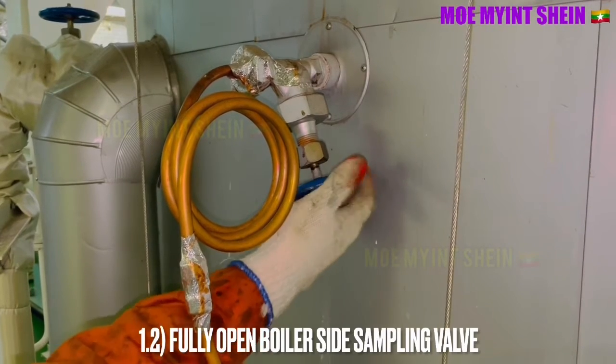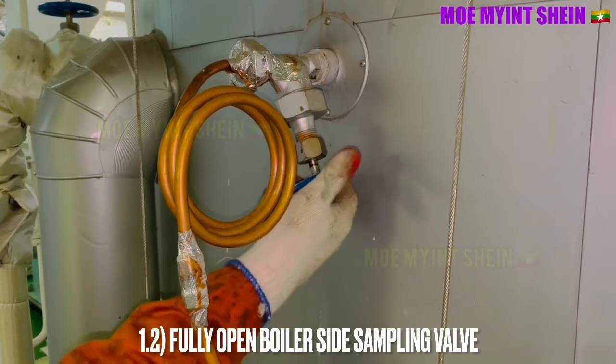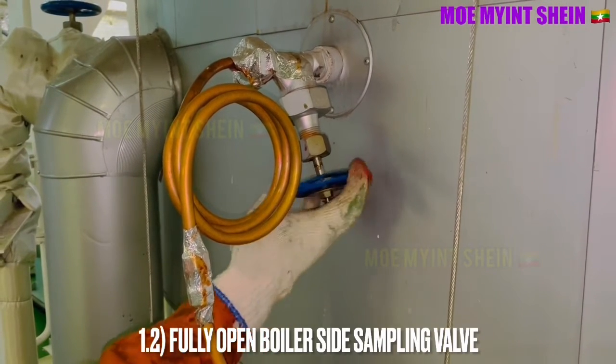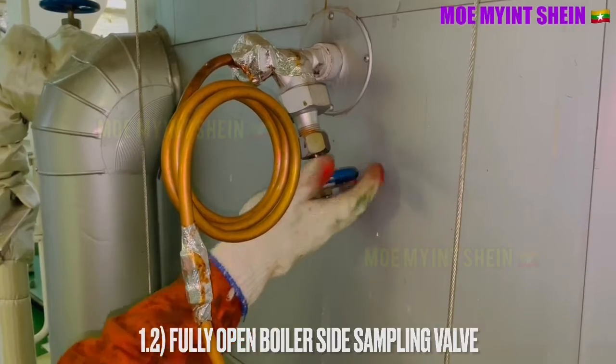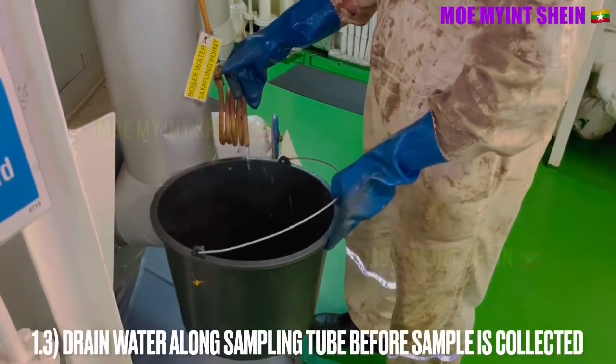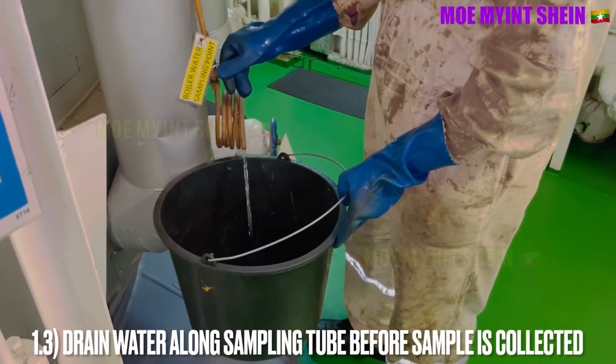Gradually open the boiler side sampling valve. After that, drain water along the sampling tube before the sample is collected.